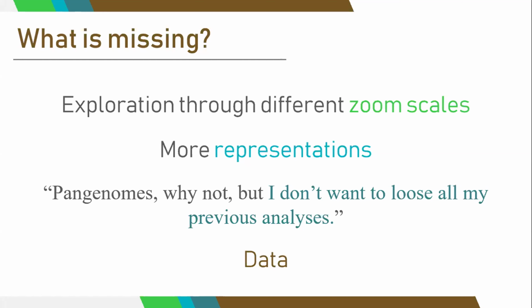Most importantly, the data. Something that can be quite difficult is that there is no standard format for the genome files. But as you know, visualization and data are directly linked.